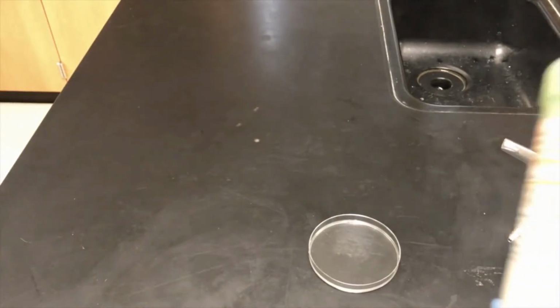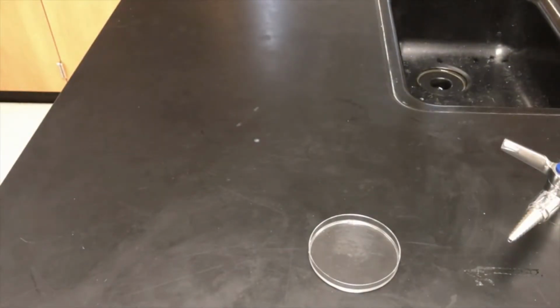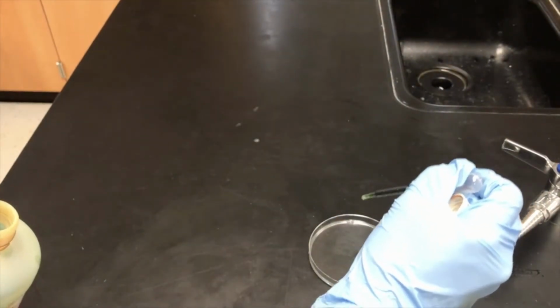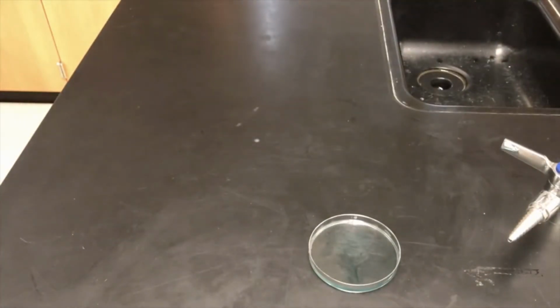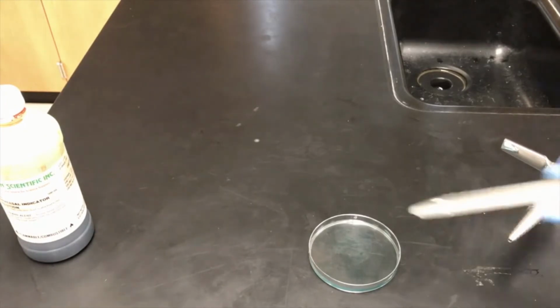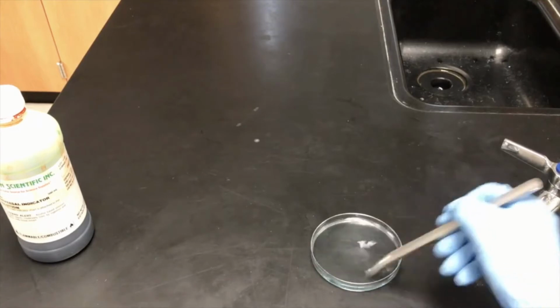The other solution I need is my universal indicator. Okay? So I'm going to grab a pipette. I'm going to add just a couple of drops of my universal indicator. Okay? And then I'm going to take my spatula and stir it. Okay, so it's kind of bluish in color right now.